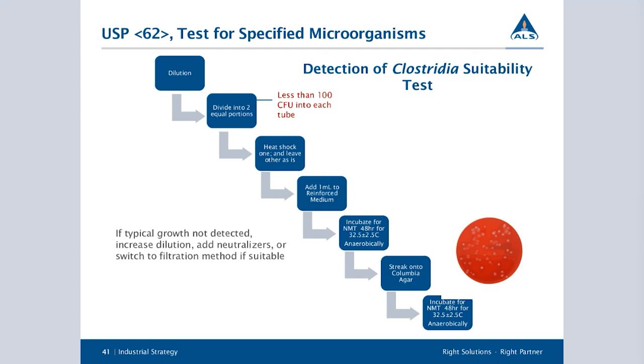Then you transfer that into the reinforced clostridial and incubate those no more than 48 hours anaerobically. Clostridium is a strict anaerobe, so all the test conditions of the broth and agar plates are incubated anaerobically.